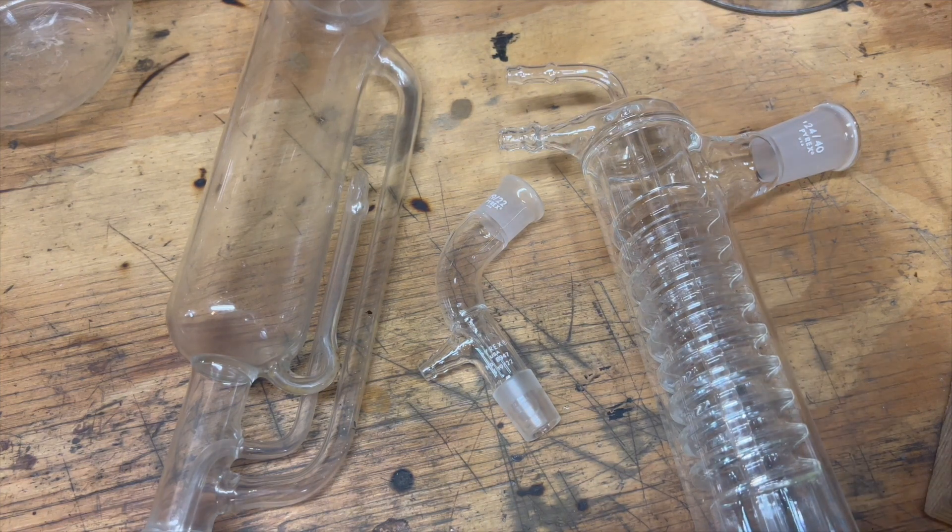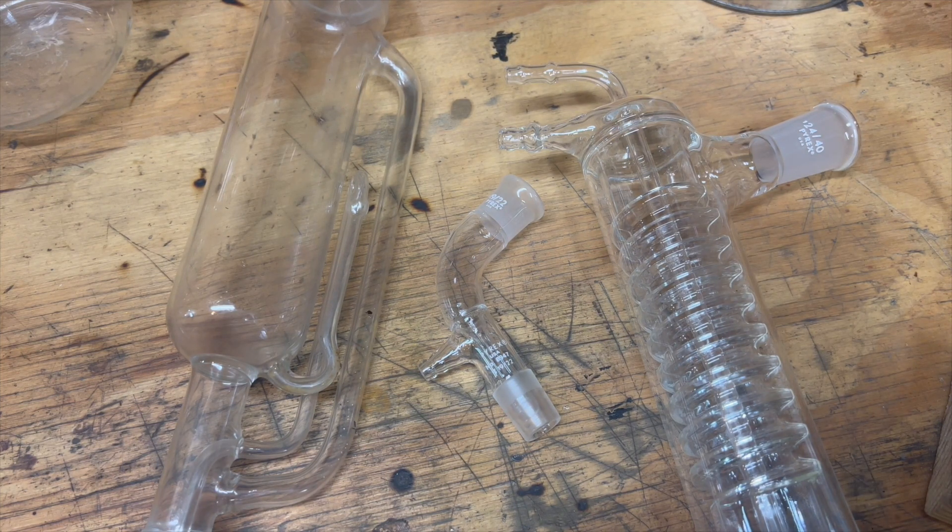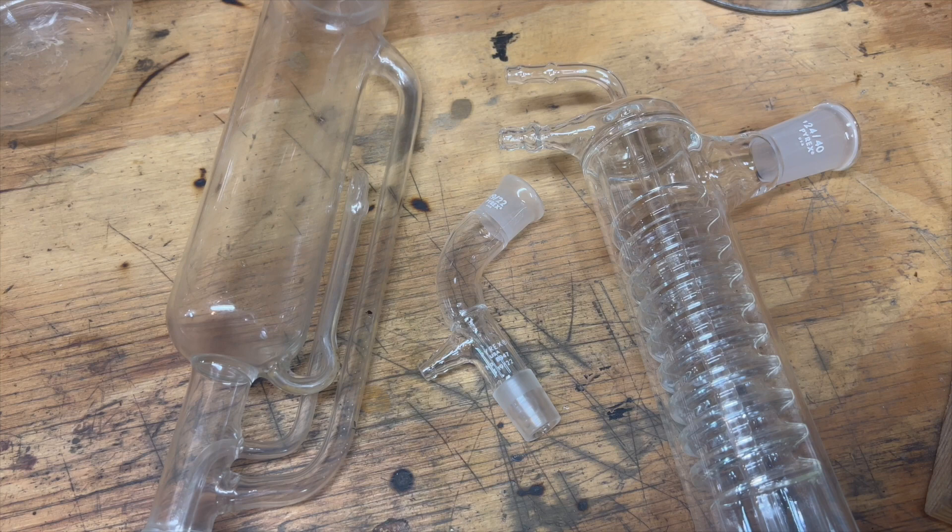Being able to bend glass tubing is crucial to making a wide variety of glass apparatuses. A few examples are soxhlet extractors, condensers, and distillation heads. All these apparatuses find common use in labs around the world, and being able to make and repair these is a crucial skill that is very important, which all begins with being able to bend tubing.